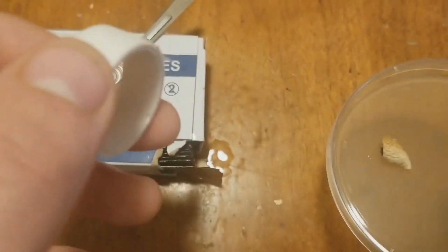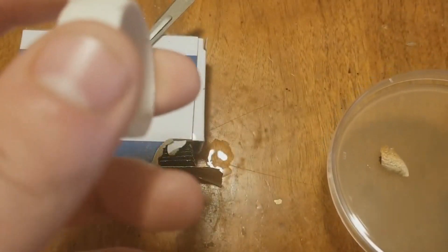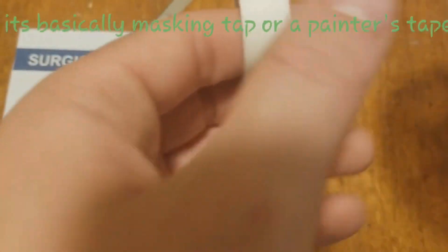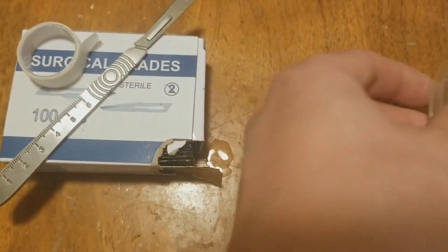Sorry guys, I'm slurring today — I'm really tired. I also have this type of tape here. It's more or less a paper tape; it's really thin and it feels like paper. You just tape the little ring here.